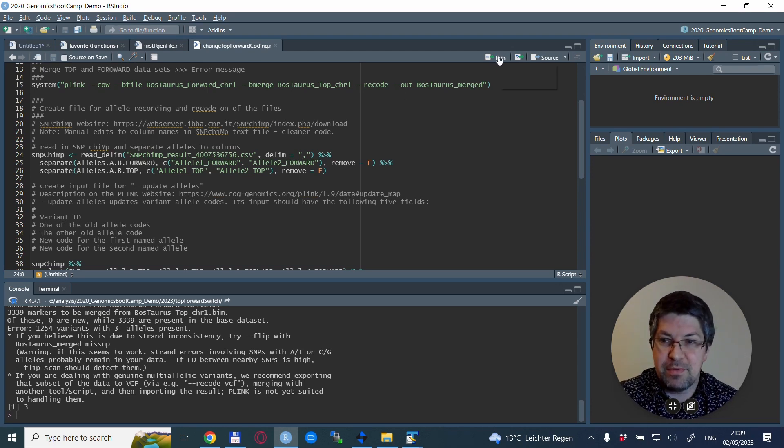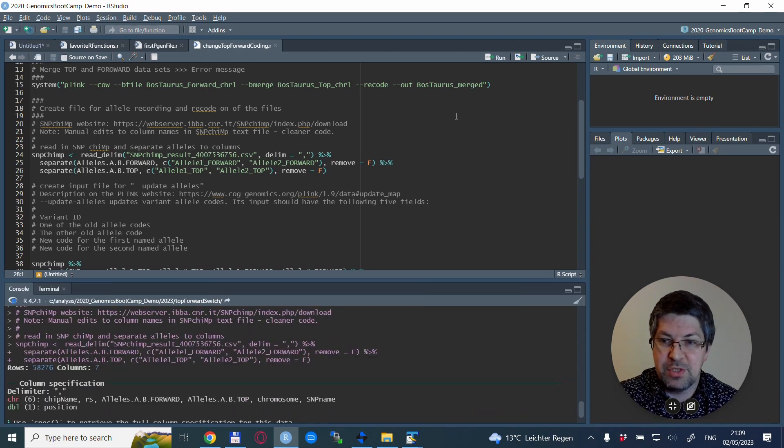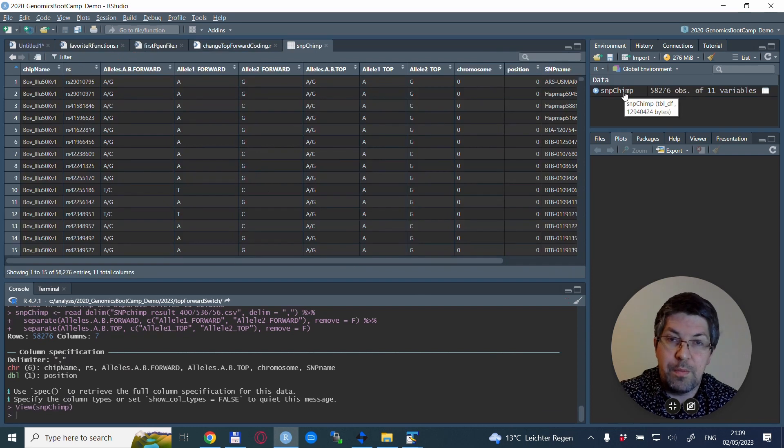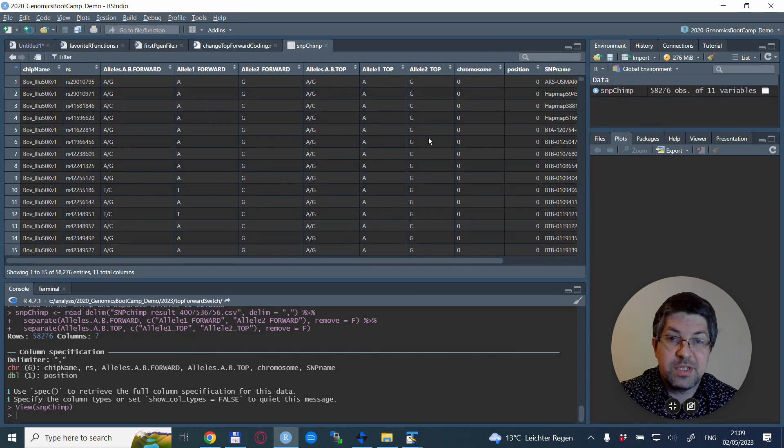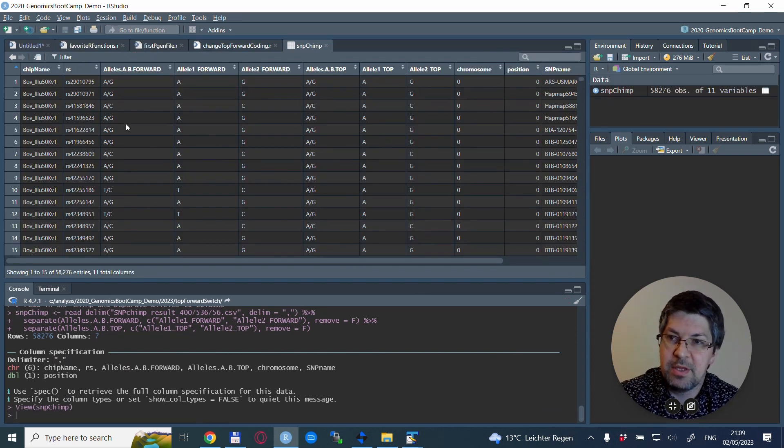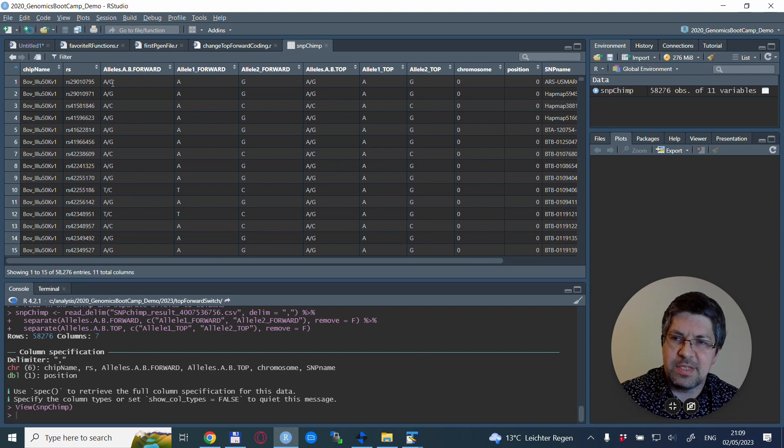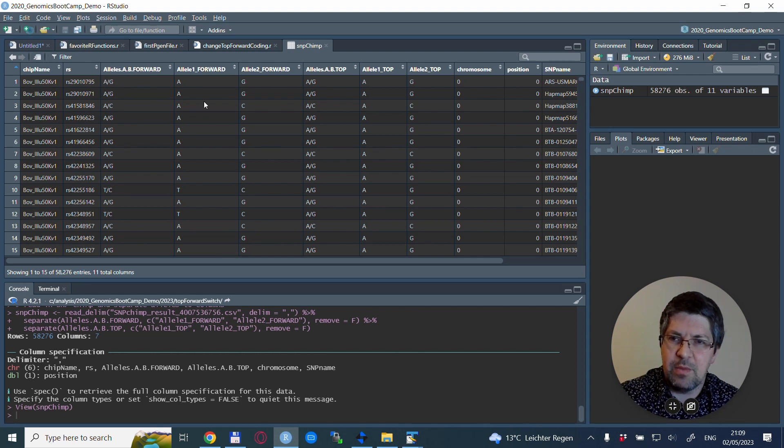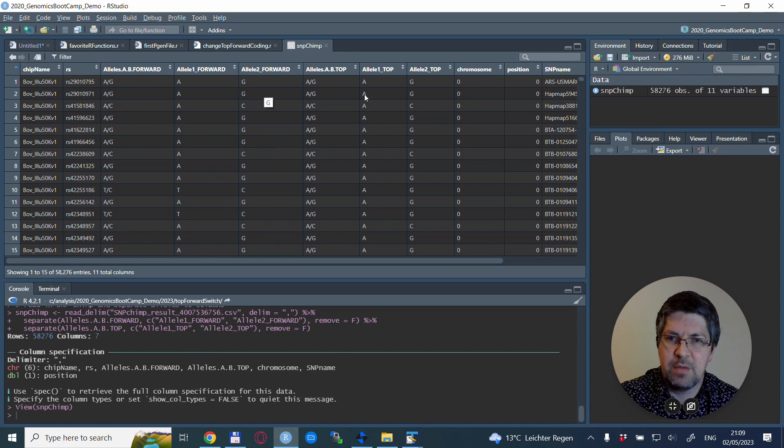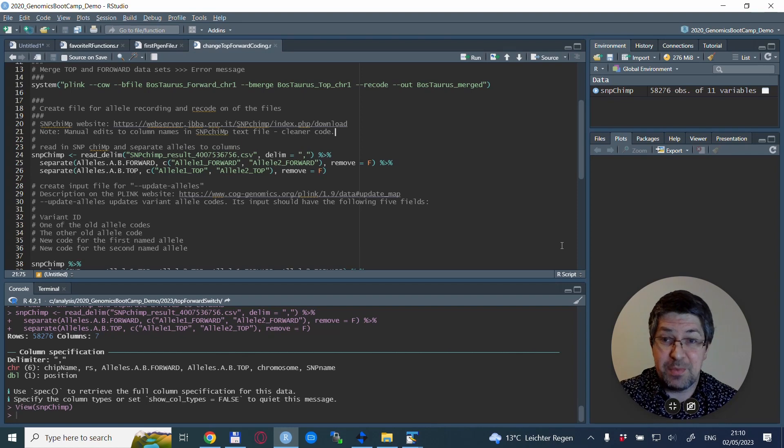We open the result file to see what happened. We had the forward coding and now it's not separated by a slash but the allele one and allele two are in separate columns, and the same thing for the TOP alleles.